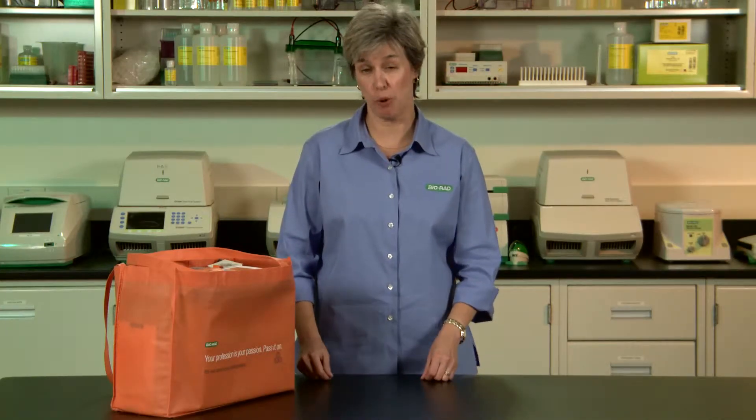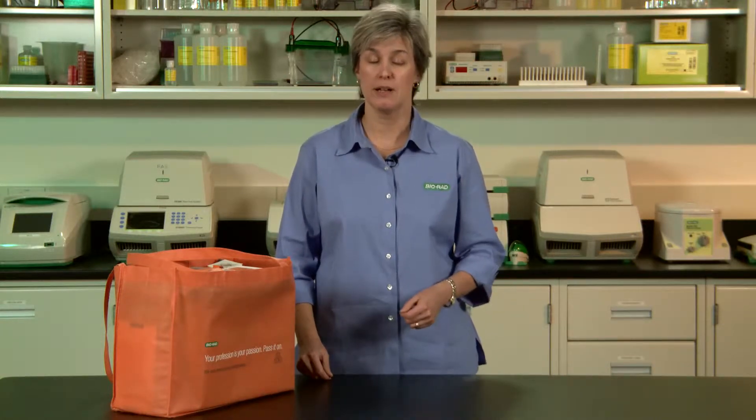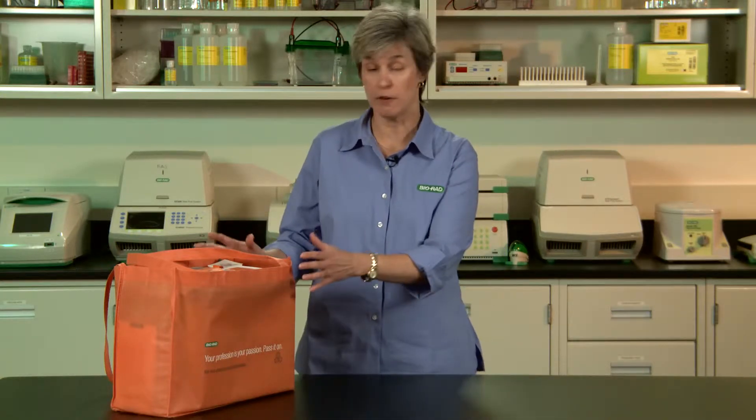Welcome to BioRad's Science Ambassador Program. We want to thank you for participating in the program and sharing your passion for science with the students. The video you're watching now is to provide you with an overview of the materials in your kit and to give you some planning and technique tips so that you'll have a very successful day.